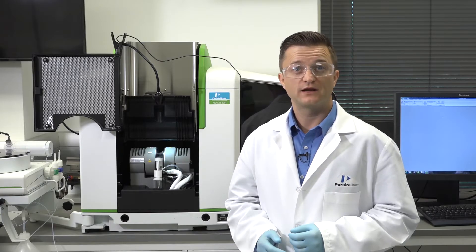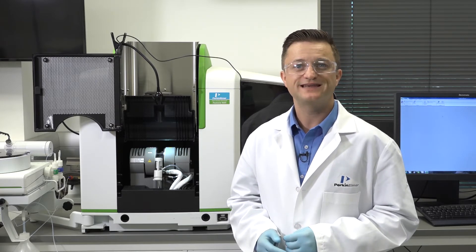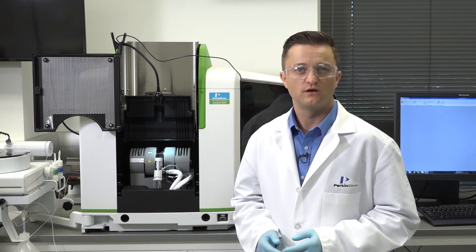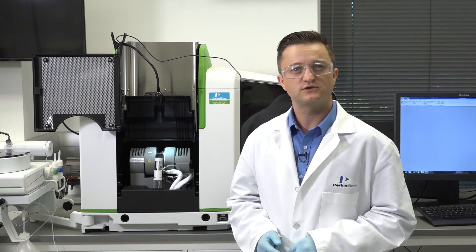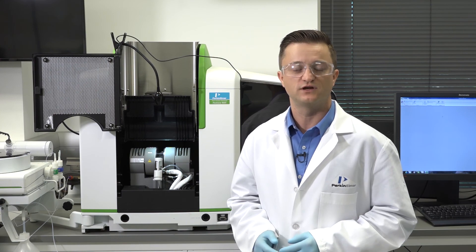Now that your contacts have been cleaned of deposits and your tube cleaned of contamination or replaced as needed, you're ready to begin your analysis. Your instrument manual and these how-to videos are great resources to help get you familiar with your AA instrument. For more in-depth information on how to properly maintain and use your Pinnacle AA system, sign up for one of our training courses or contact your PerkinElmer representative for additional options.